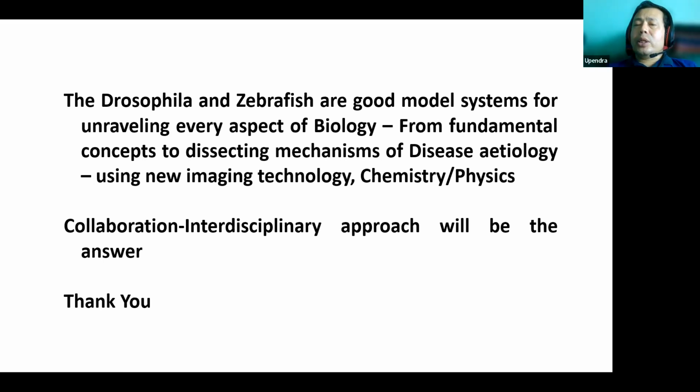But I have seen it. A student of Justin's, Gregory Mashanov, from Russia, would dismantle the whole optical tweezer microscope within 3-4 hours, because the pinhole was not correct. He would completely dismantle the microscope to pieces, then assemble it again, taking close to 12 hours.